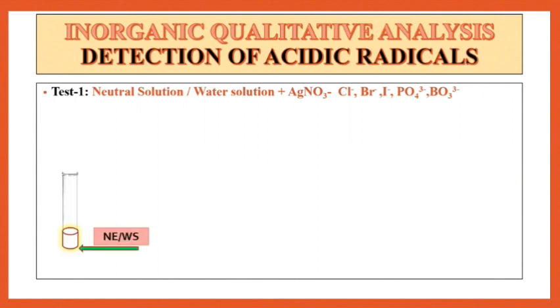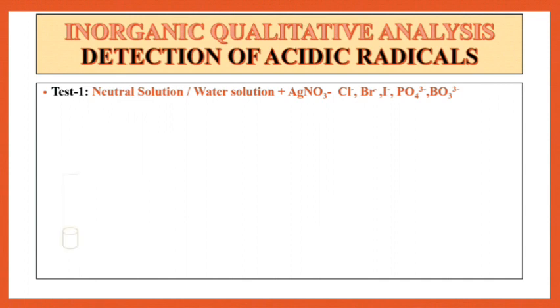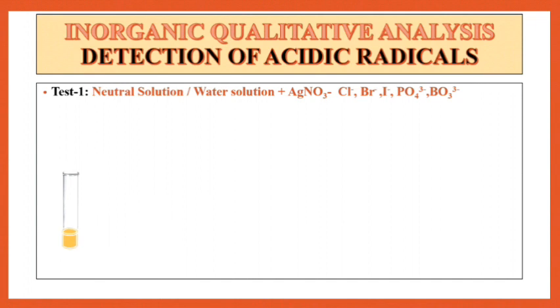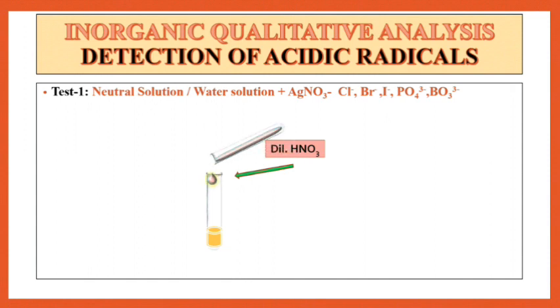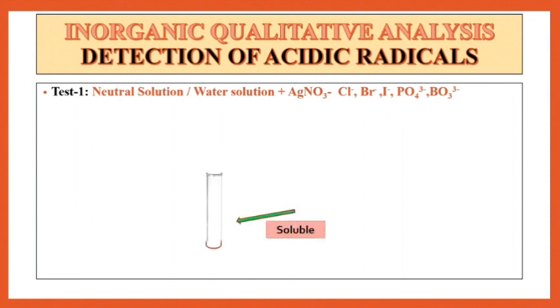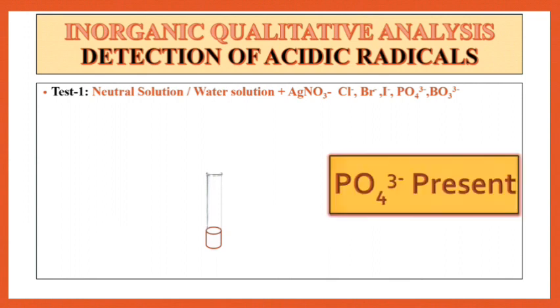Next test for the addition of AgNO3 solution: a yellow PPT is observed. Then to this yellow PPT, add dilute HNO3 drop wise. After the addition of dilute HNO3, shake it well. It is soluble in dilute HNO3. So PO4³⁻ is present.